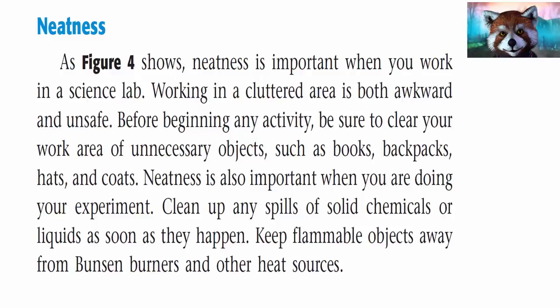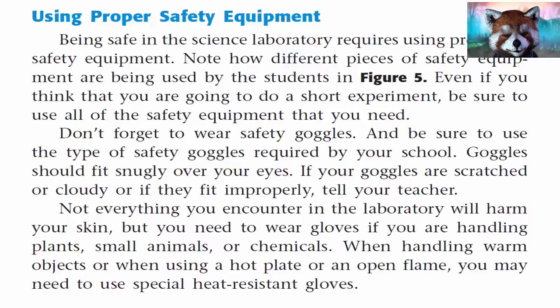Neatness is also important when you are doing your experiment. Clean up any spills of solid chemicals or liquids as soon as they happen. Keep flammable objects away from Bunsen burners and other heat sources.